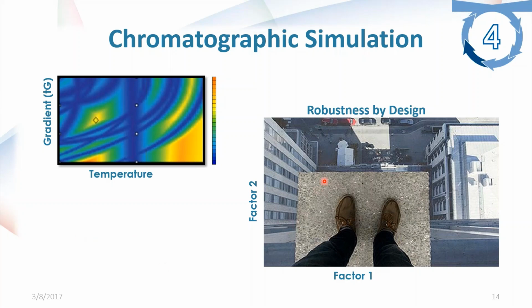Taking a look at the right-hand side, while it's important to have a large platform or good robustness, it's equally important to have knowledge of where the edges of failure are. You don't want to be stepping too far over on the right or the left here, but it's good to know how far over you can move.